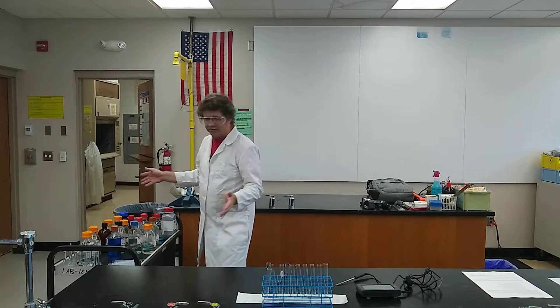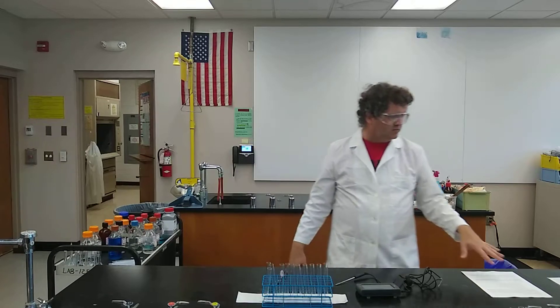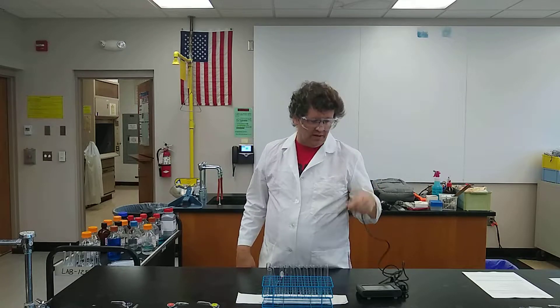Right behind us are all the chemicals that we're going to use. I am going to do them just in order, and also, because some of these are endothermic and exothermic reactions, we're going to measure the temperature of them as they go.